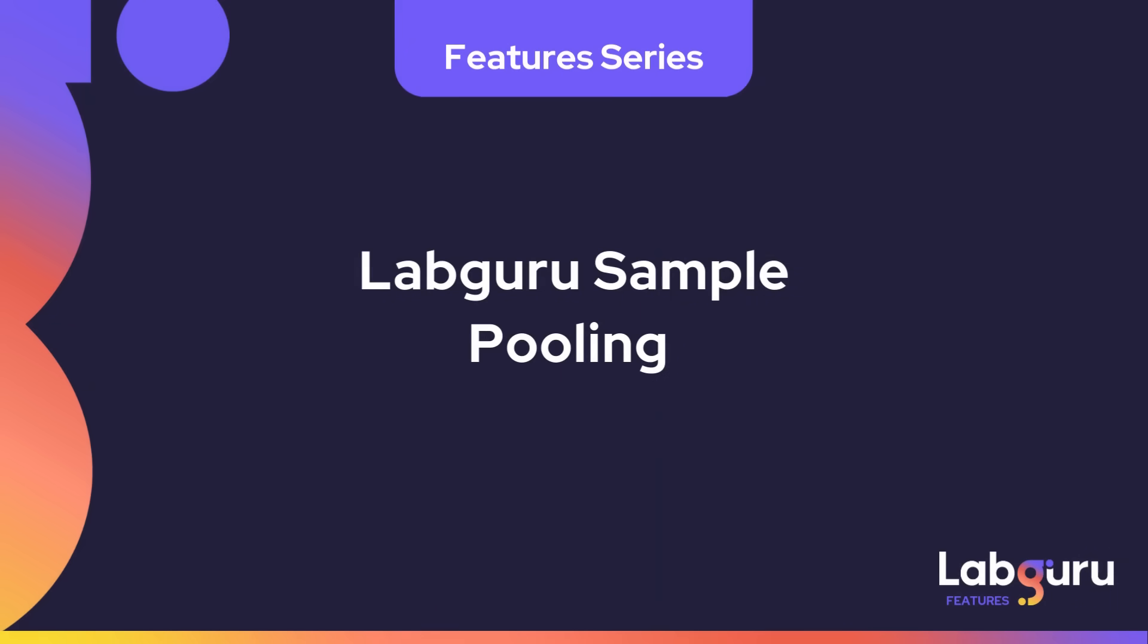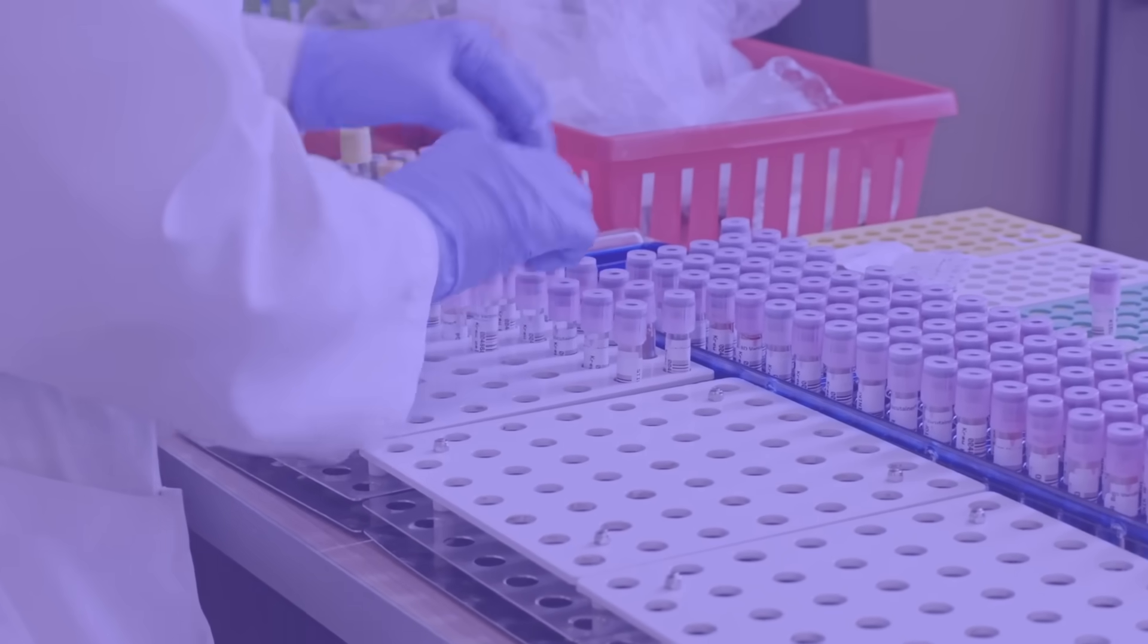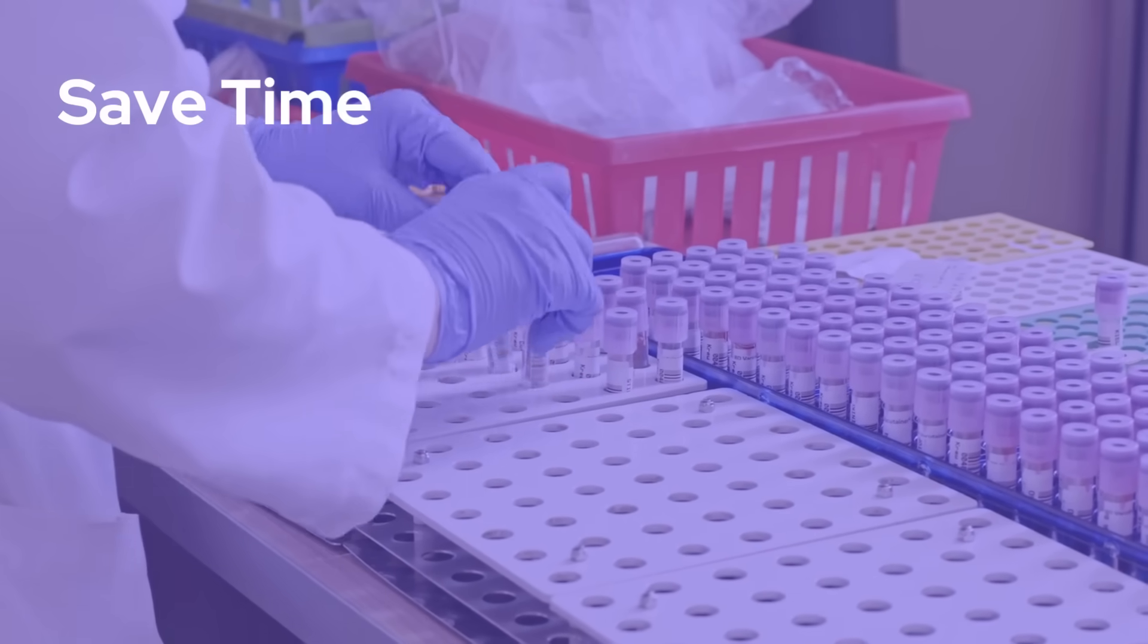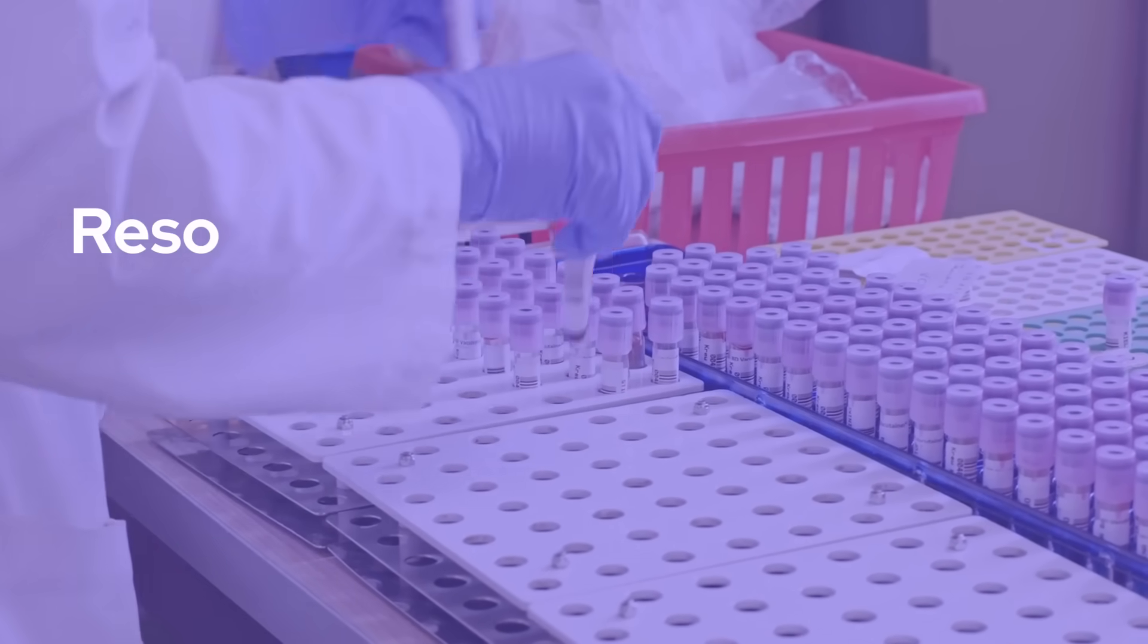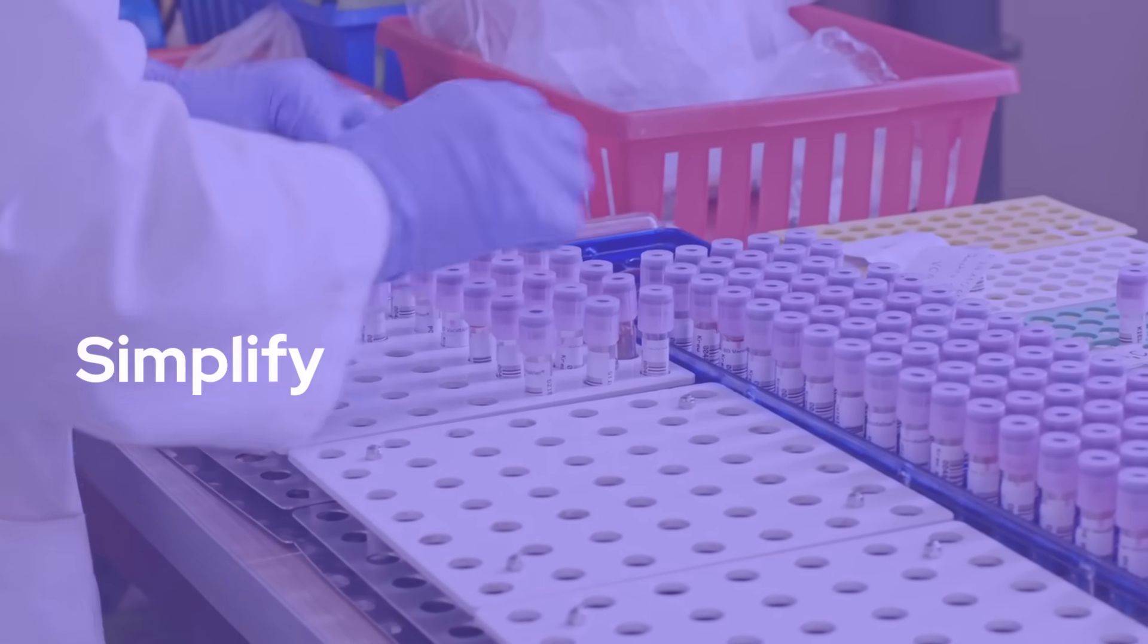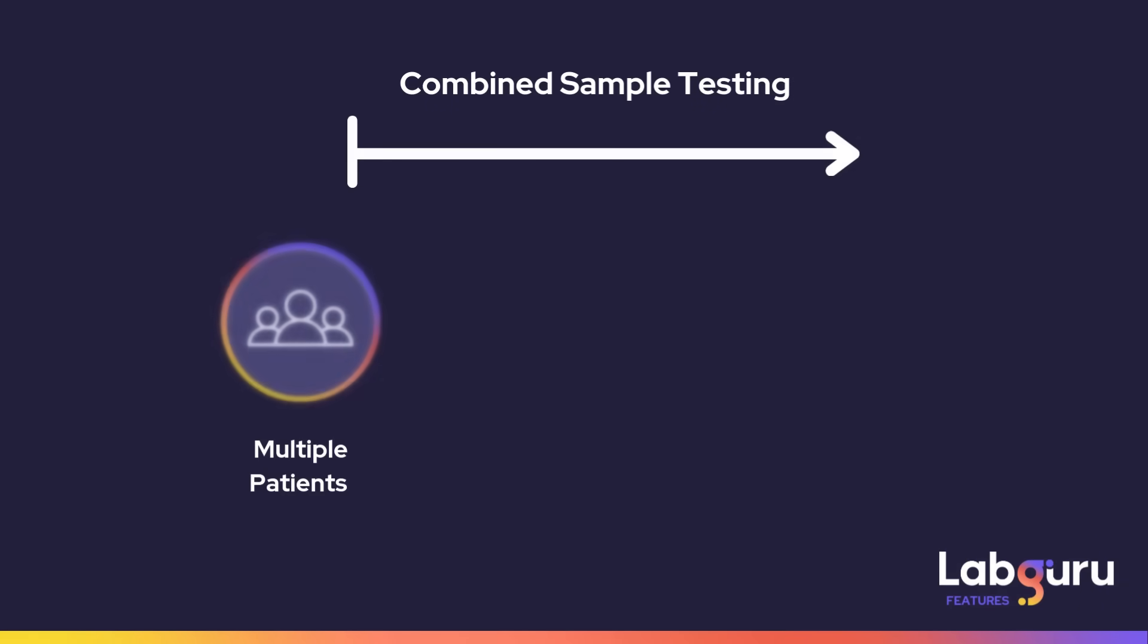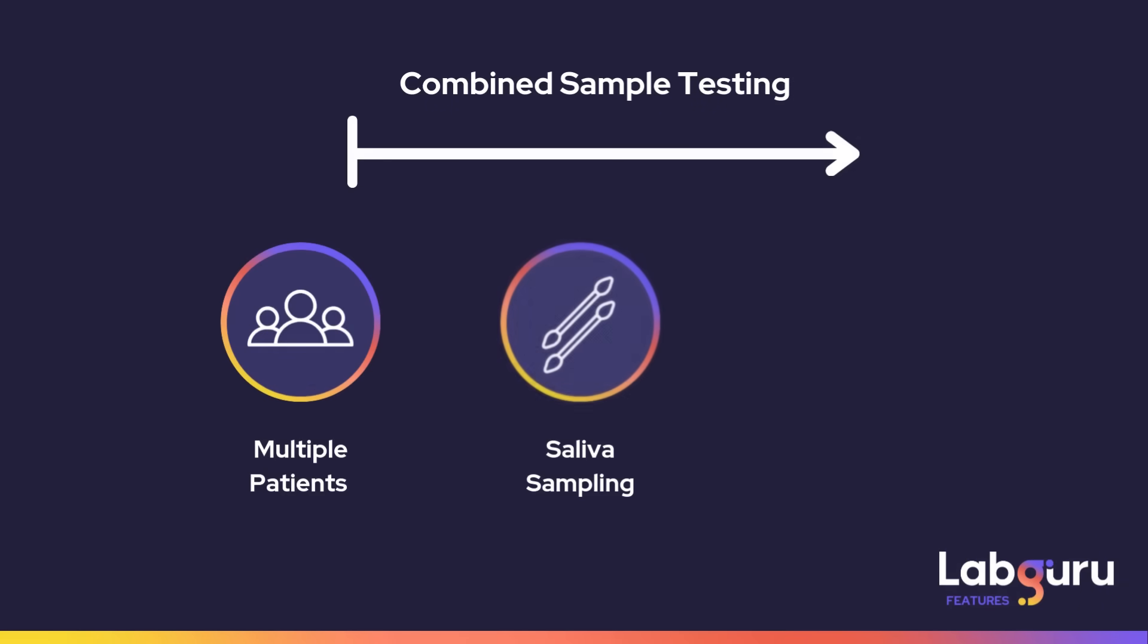Meet Labguru's sample pooling feature, allowing you to combine multiple samples into one. With Labguru sample pooling, you can save time, resources, and simplify data management. In this video, we'll demonstrate pooling saliva samples as part of a COVID testing process.